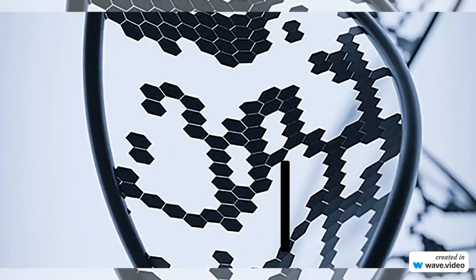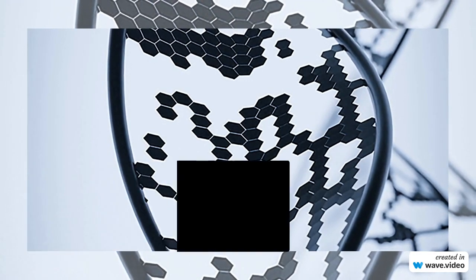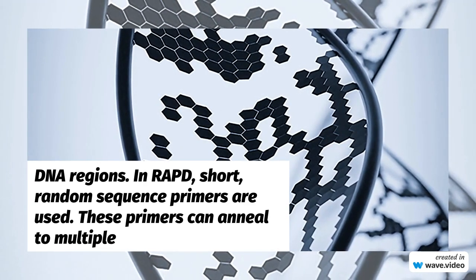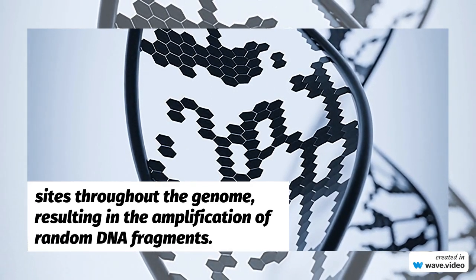PCR amplification. The RAPD technique utilizes PCR, Polymerase Chain Reaction, to amplify specific DNA regions. In RAPD, short random sequence primers are used. These primers can anneal to multiple sites throughout the genome, resulting in the amplification of random DNA fragments.